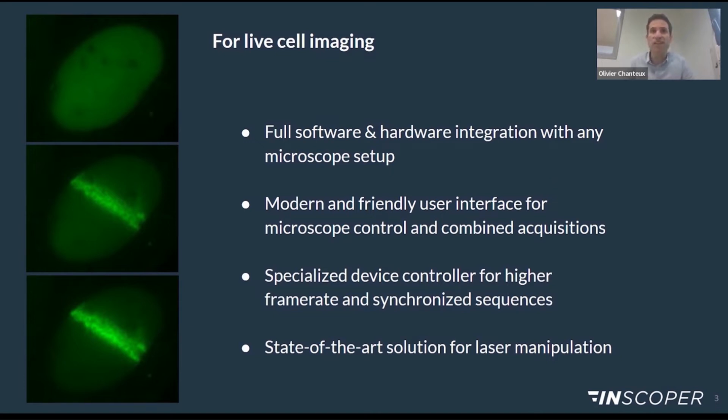It means that this is not only about adding a new imaging technique on your microscope, but it is also replacing its current acquisition software with the automation and image acquisition solution from Inscoper. Users will benefit from a modern software environment to easily set up their multidimensional acquisition sequences, including or not photomanipulation techniques. This is of course interesting to upgrade or renew an aging microscope, but it is also a good solution to build and customize a new system with FRAP modalities.